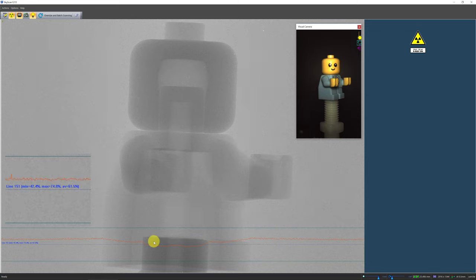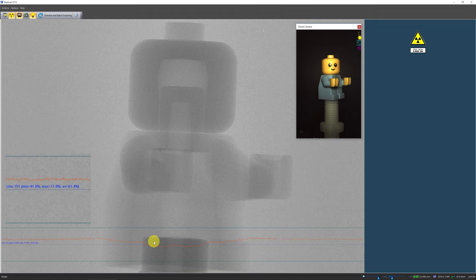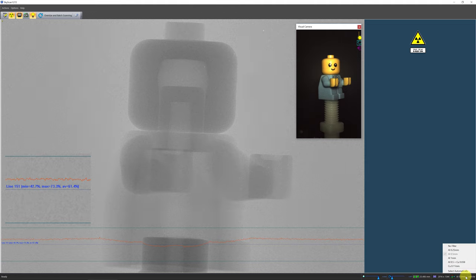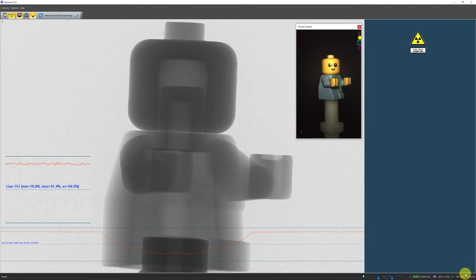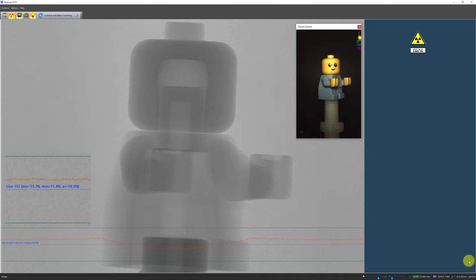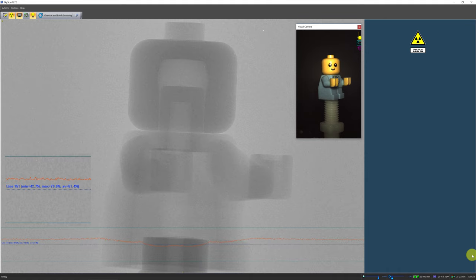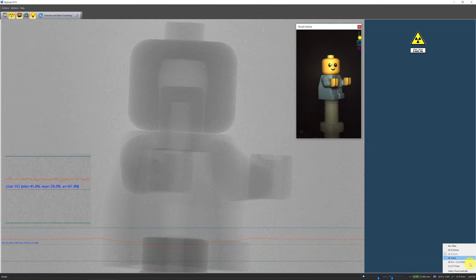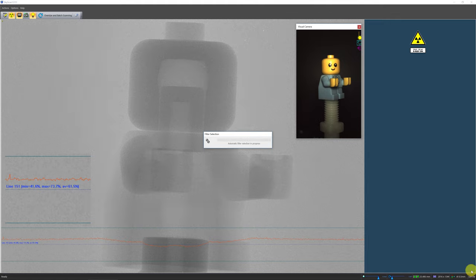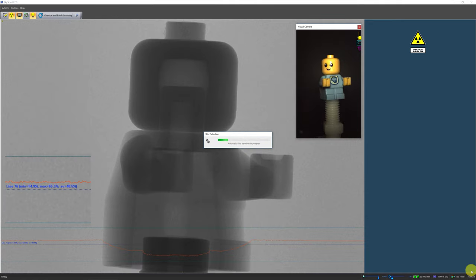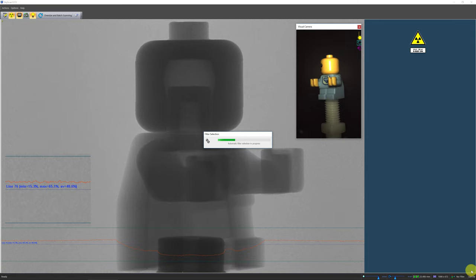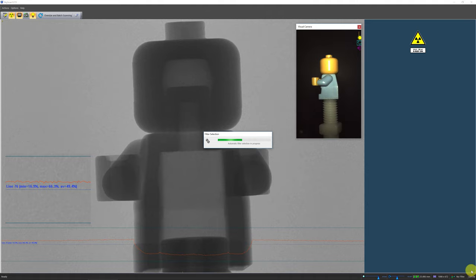If possible, aim for 30% minimum transmission while setting up your sample. The Skyscan 1272 includes a six-position automatic filter changer, where you can see the filter options in the status bar. The peak x-ray energy outputs have been optimized for each filter option. You can select the filter manually in the status bar to inspect the transmission profile, or you can use the 'select automatically' function in the filter selection column. This function will select the filter for you based on your sample's x-ray transmission profile, aiming for a minimum transmission between 10 and 50%.